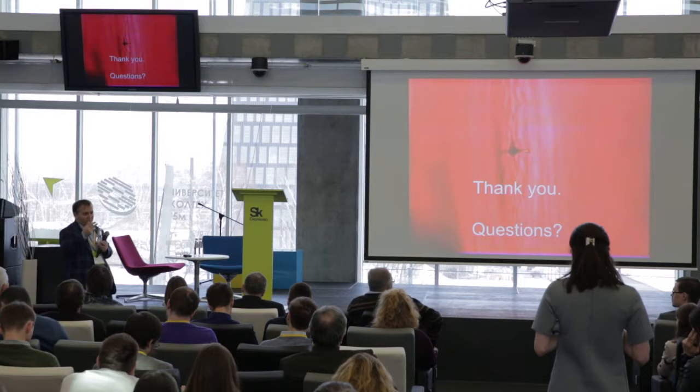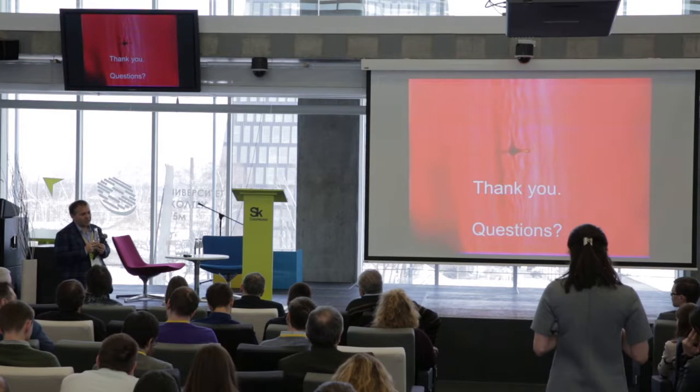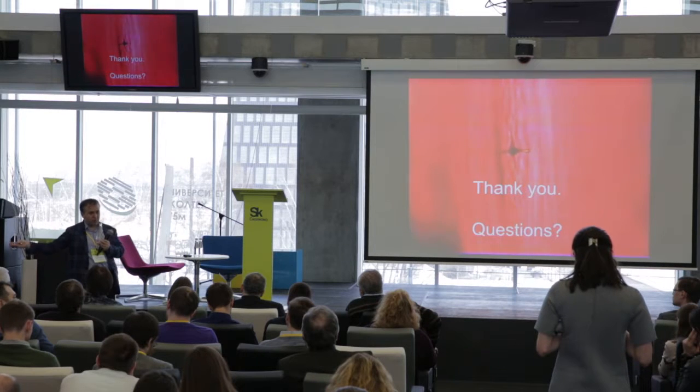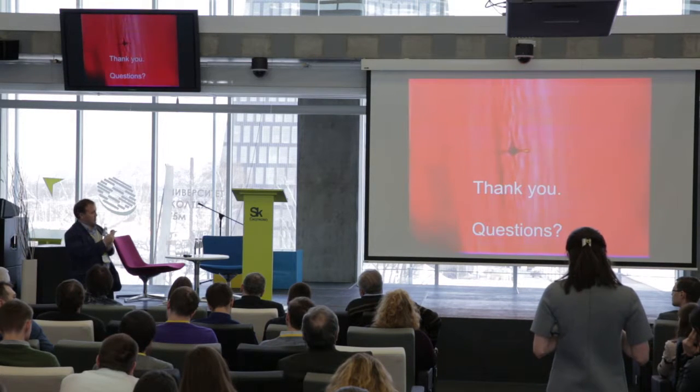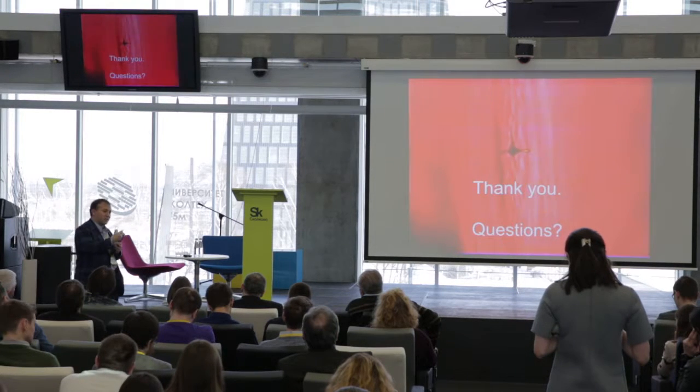One question that could come, and I'm trying to give a thorough answer because I studied this quite a bit, is whether exposing the cell to this mechanical effect would change it phenotypically, genomically, or proteomically. It takes us about 10 seconds to apply the wave, which is not long enough to create any shock proteins or turn the cell into something that it isn't.